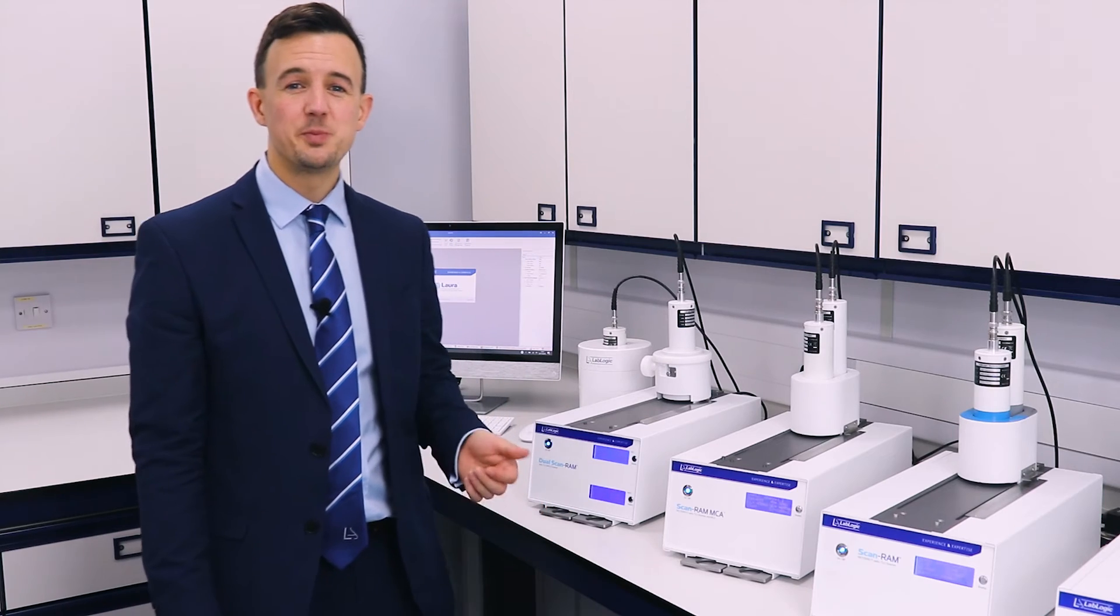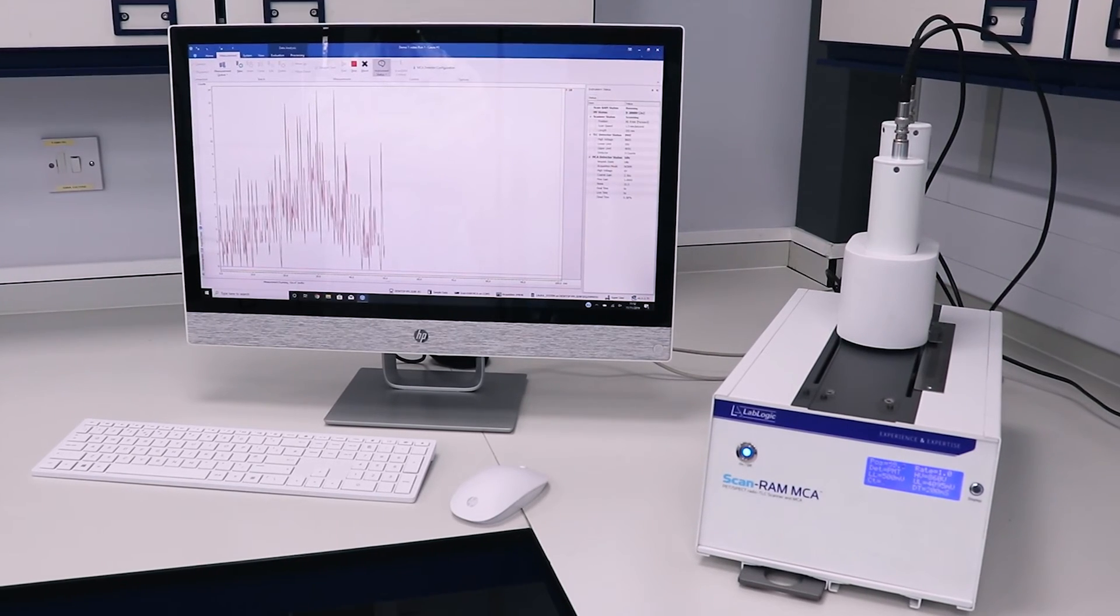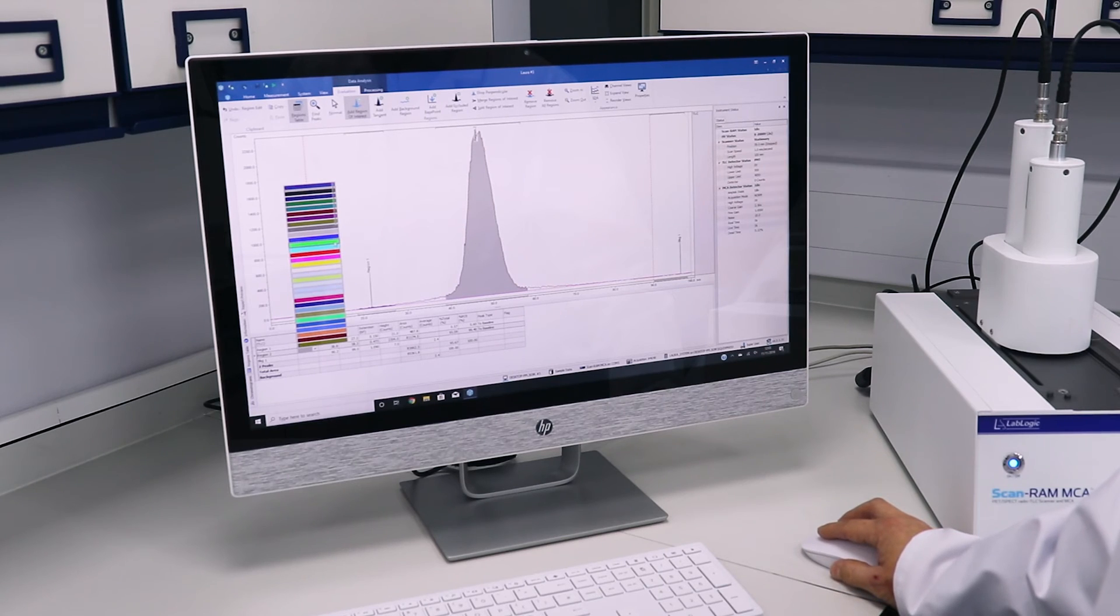The ScanRAM MCA is perfect if you want to combine radiochemical purity and radionuclide identity in one run. This MCA version includes a dedicated detector with a multi-channel analyzer. Once the radio chromatogram has been acquired the MCA detector measures the energy spectrum of the main peak thus confirming the identity of the radionuclide.